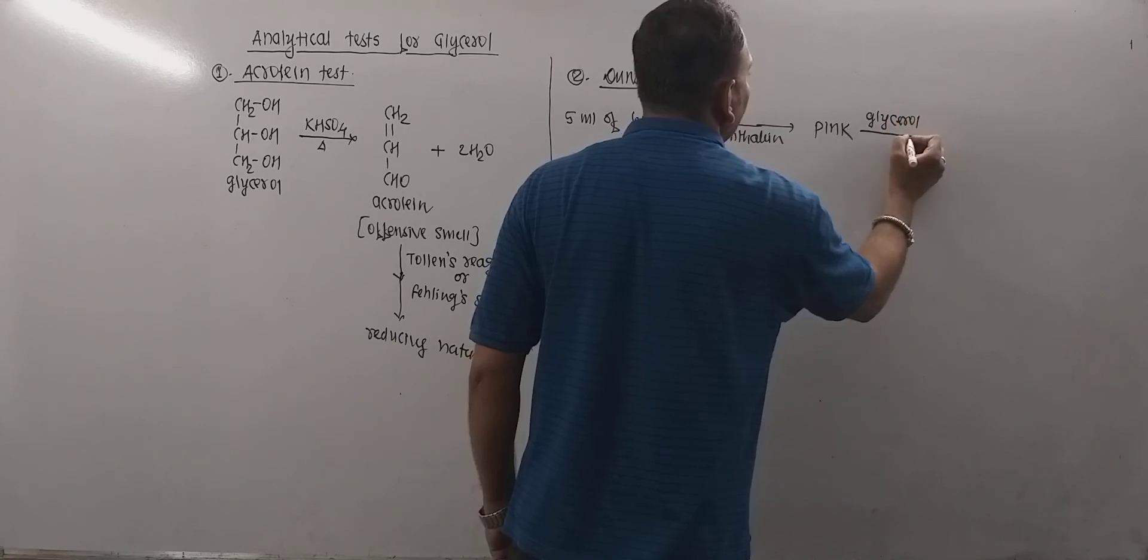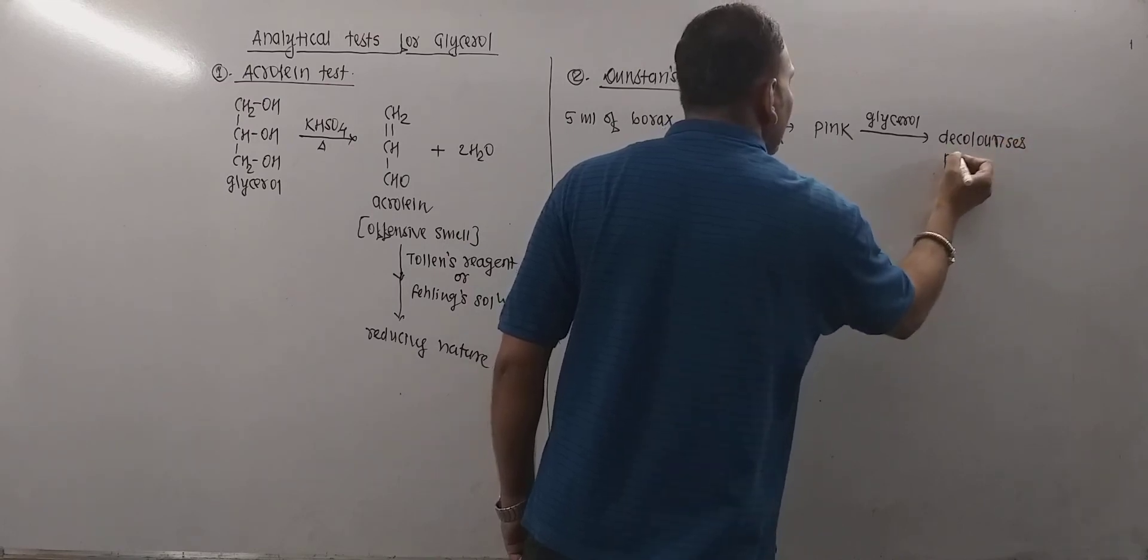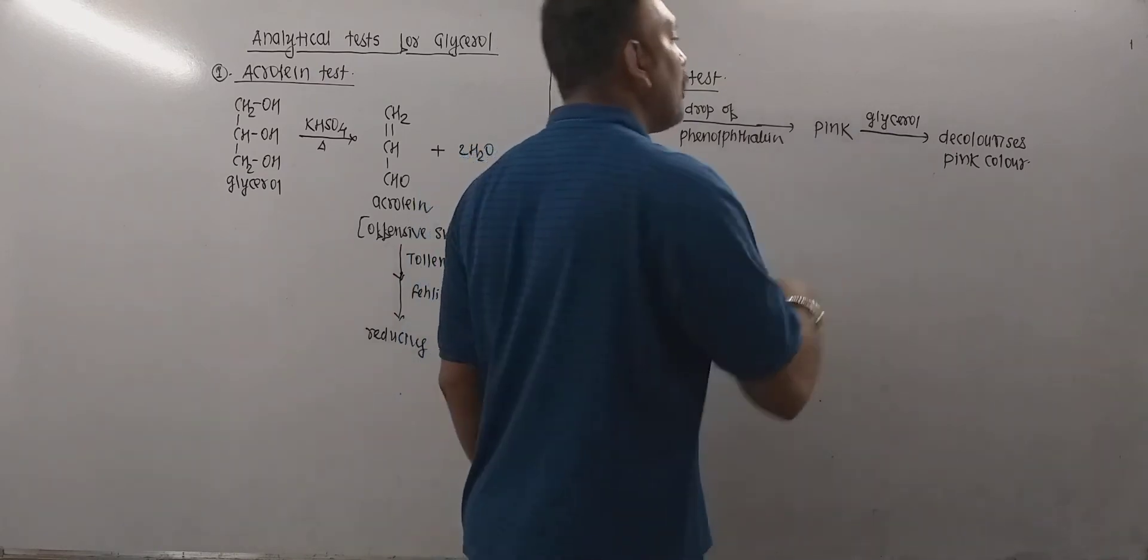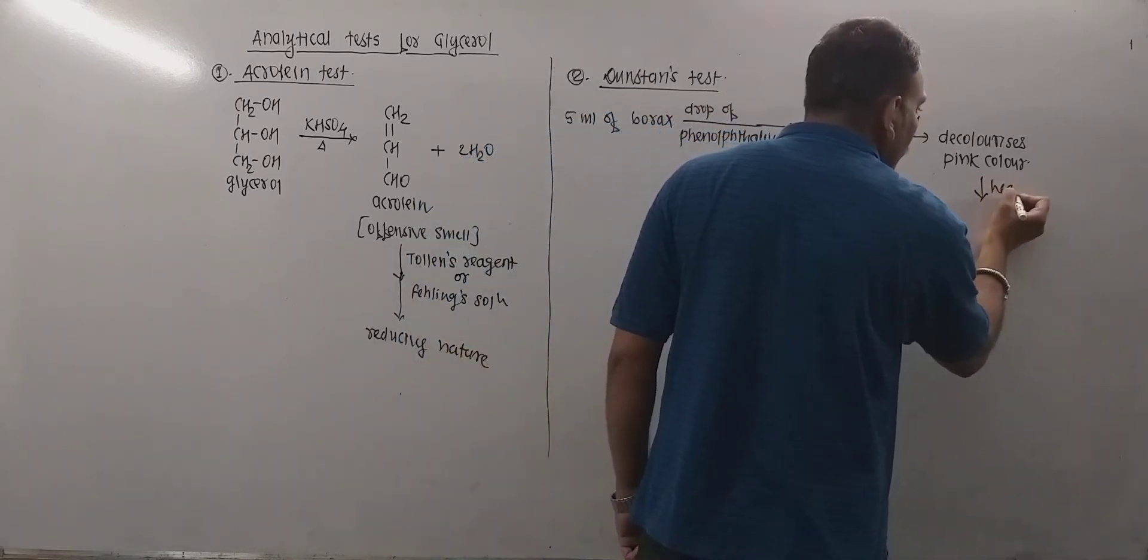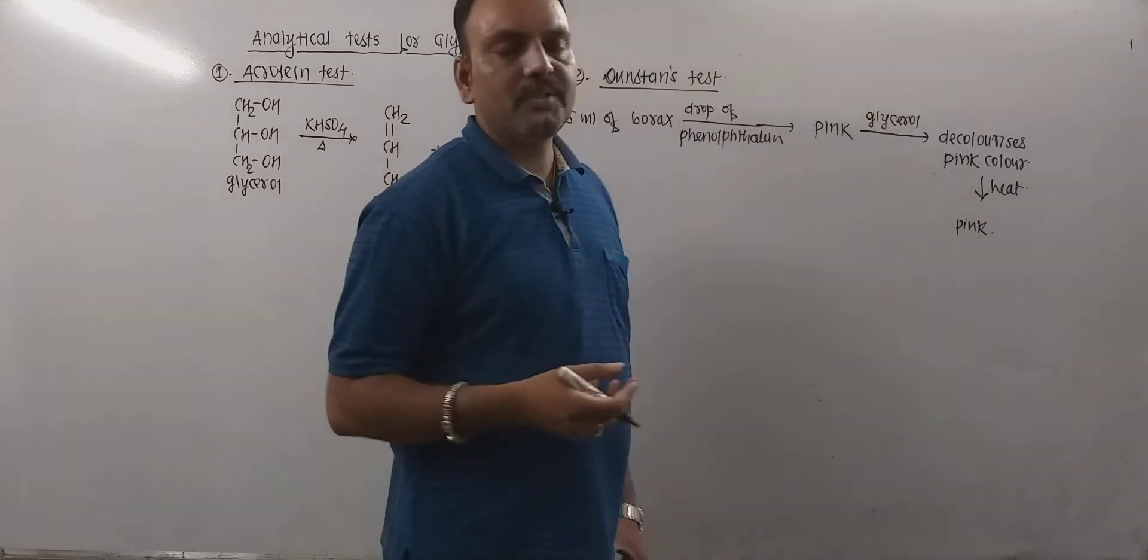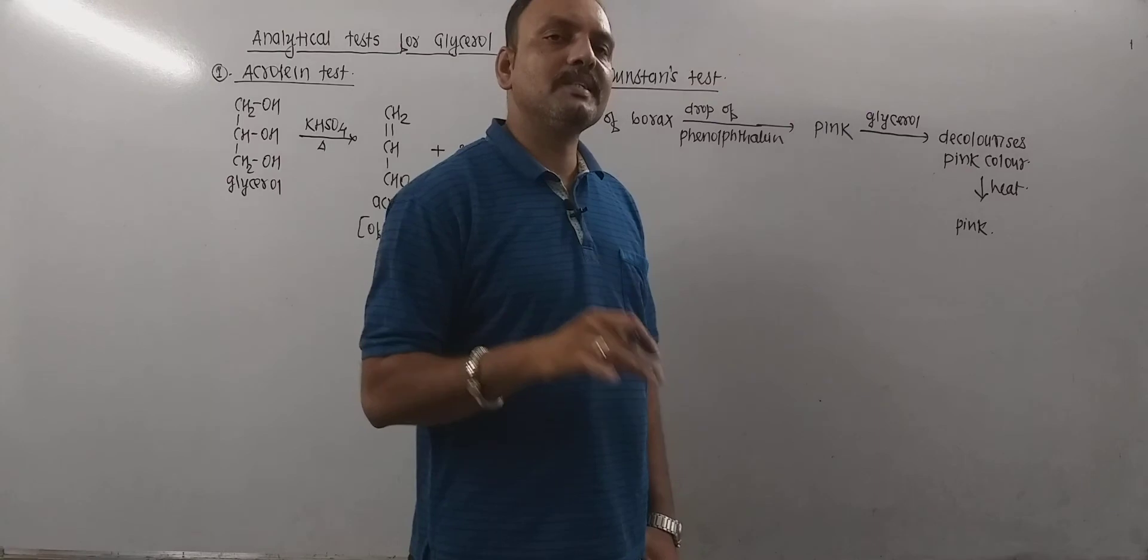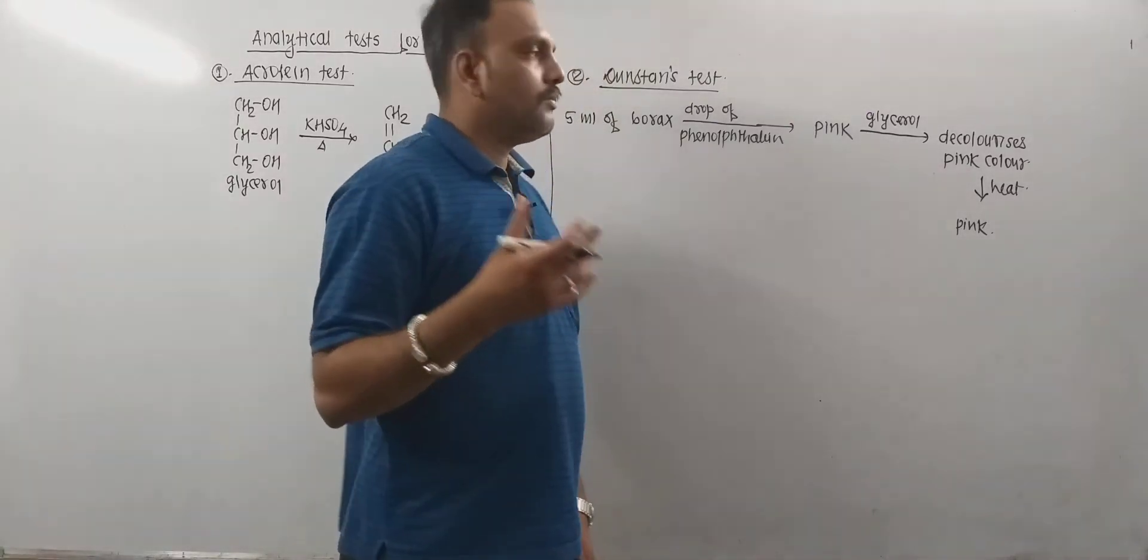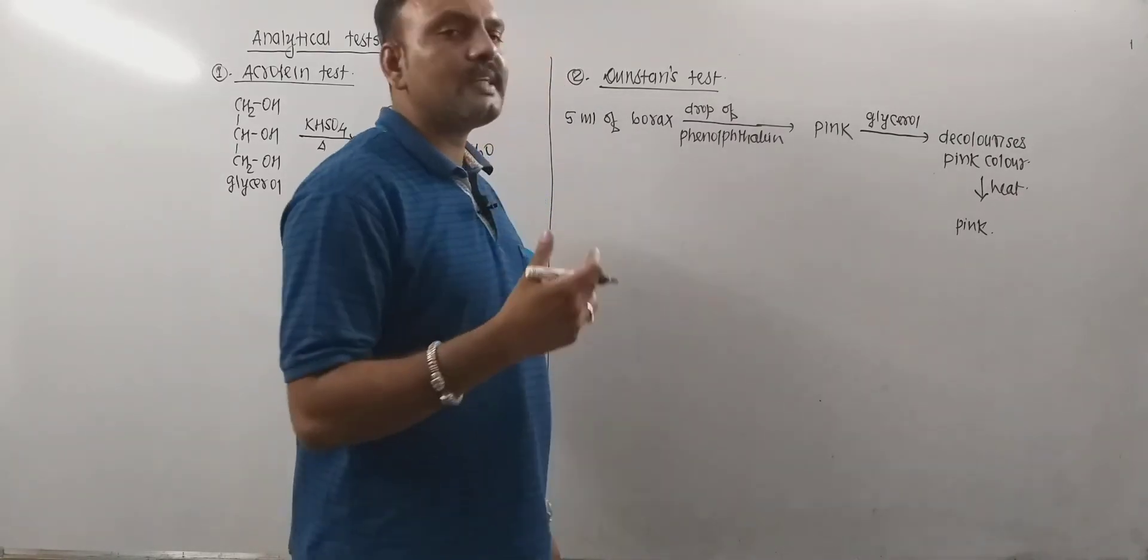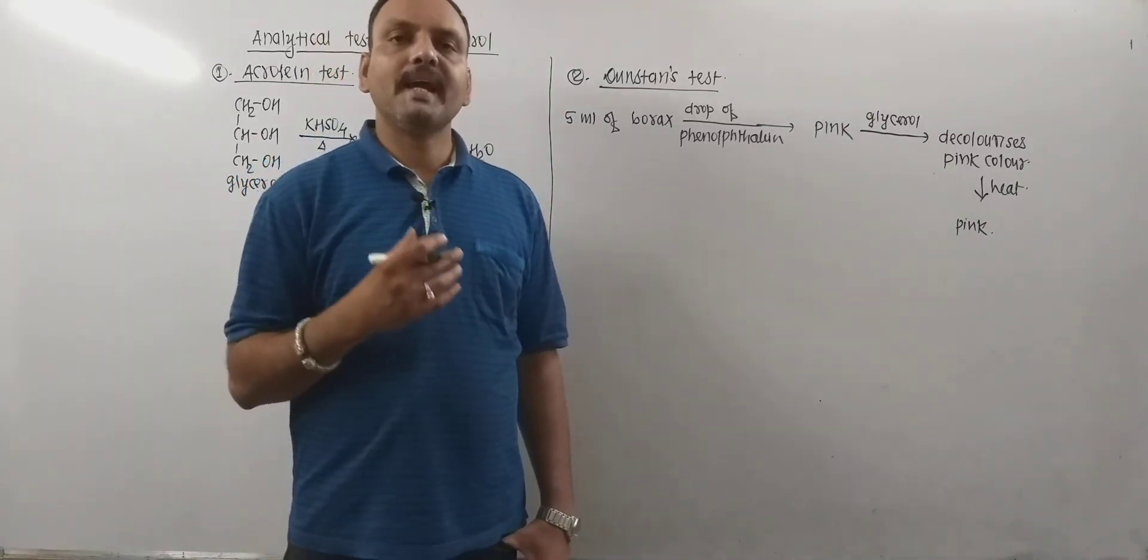And on heating, if we heat the same, then on heating again pink color generates. So on heating pink color appears and on cooling pink color disappears. So by the help of the color change indicated, it confirms that the given sample is of glycerol. So these are the analytical tests for glycerol. Thank you very much.